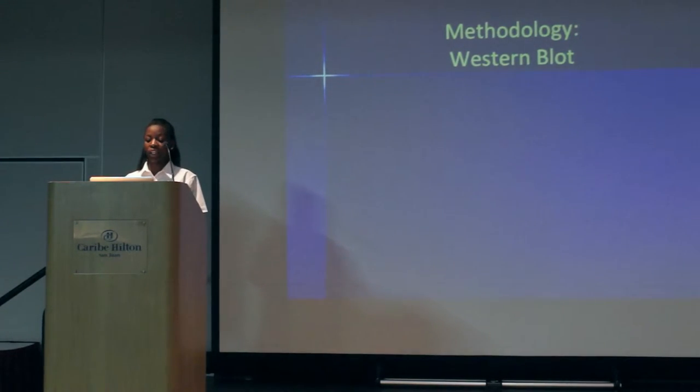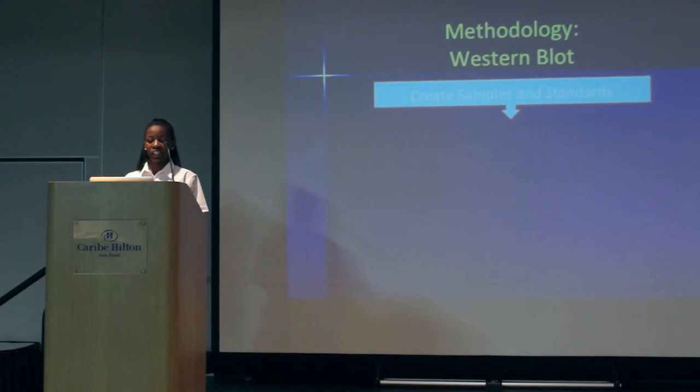So the next experiment that we conducted was the Western blot. This procedure is known to be a more quantitative protein detection method because it lets us know how much of HF1 exactly adhered to in the cells. First, we ran our standards and samples.